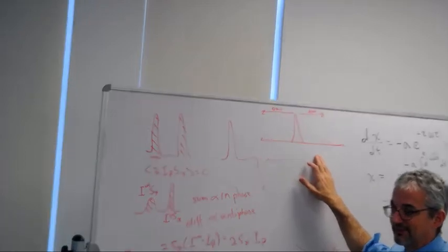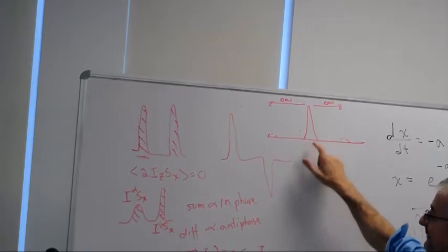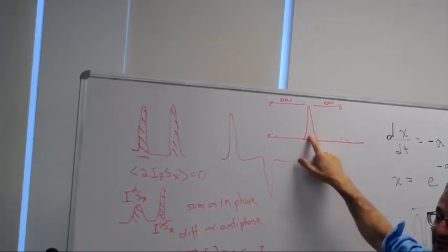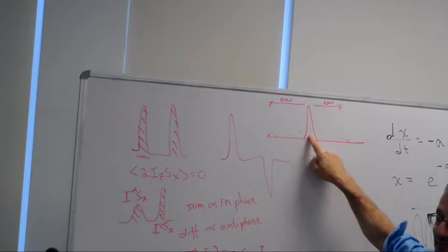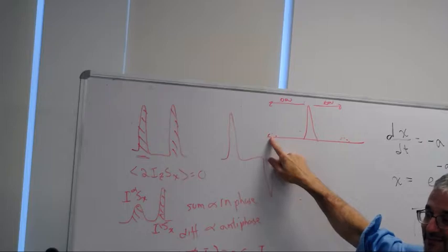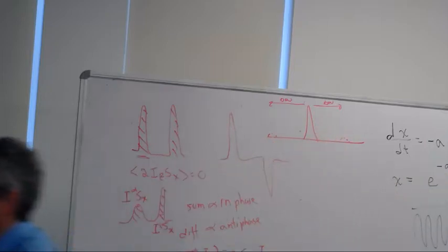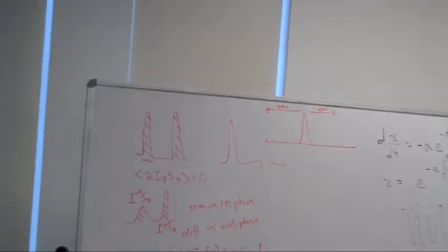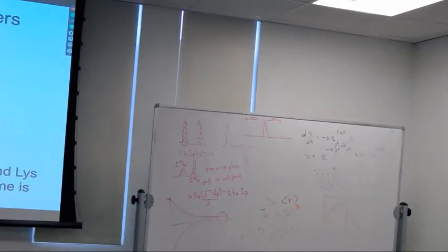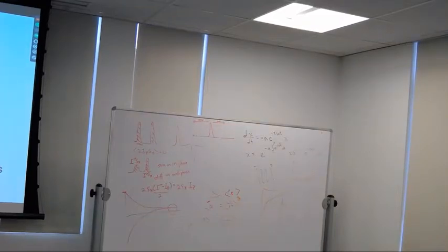Sometimes we might be able to guess which is right by looking at distributions of chemical shifts. If this peak is already at the edge, the downfield edge of the distribution of shifts, then this probably isn't the right answer. But most of the time we don't know. And that's a downside to the CPMG experiment that is rectified somewhat by the R1 rho experiment.